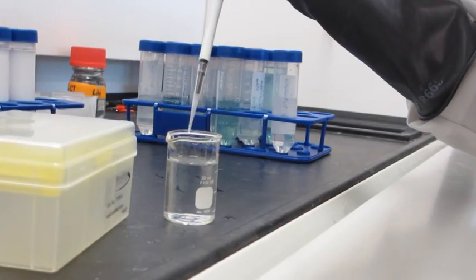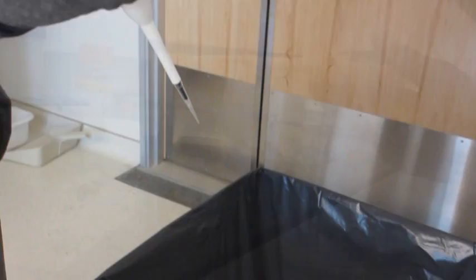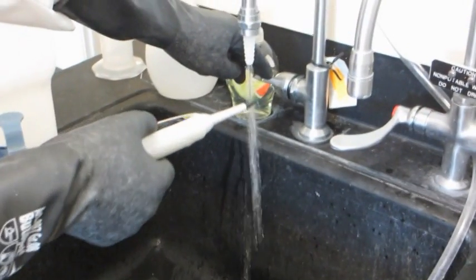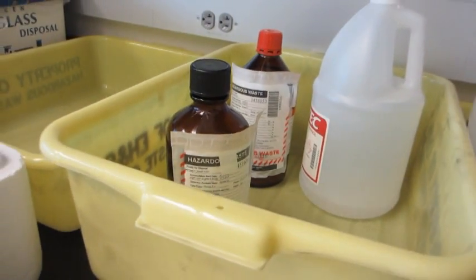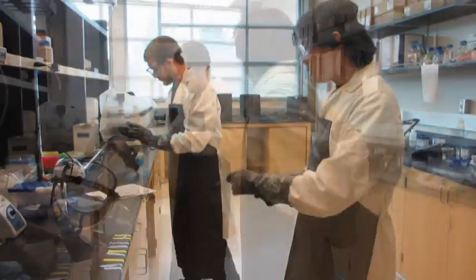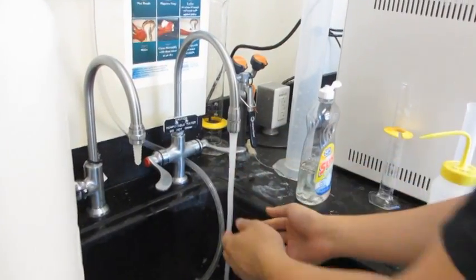Afterward, ensure that you decontaminate the work surface. Thoroughly rinse all equipment and measuring containers, collecting the first rinse as hazardous waste. Then wipe down the work area to prevent chemical residue. Collect unused hydrofluoric acid as hazardous waste in a labeled plastic container, following the procedures from Environmental Health and Safety. Practice good personal hygiene by decontaminating affected clothing, removing personal protective equipment, and washing your hands for at least 20 seconds under warm soapy water.